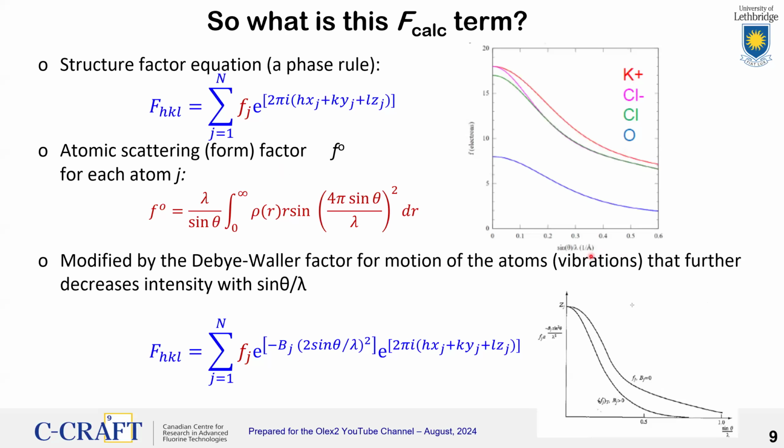So everything is indexed to the wavelength and made wavelength independent. And this is an integration which involves the electron density at some distance. Again, that distance is determined by the geometry.